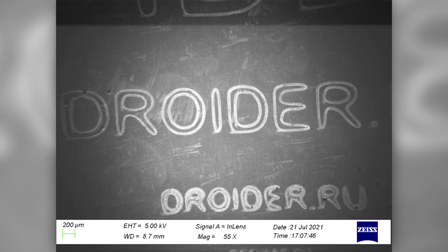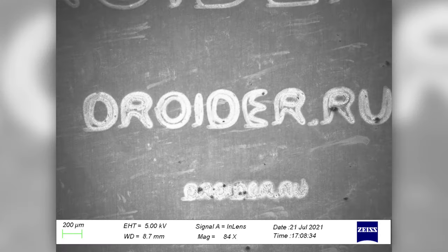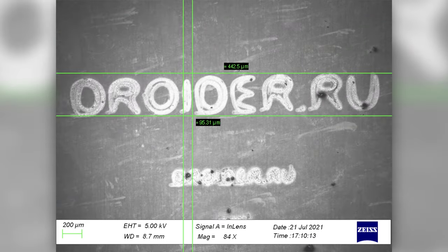You can already see the inscription DROIDER with a magnification of 55x. We're going down to the smaller inscription now. I wonder how thick the letter I is in this inscription — let's take a closer look. Only 100 micrometers — slightly thicker than a human hair.